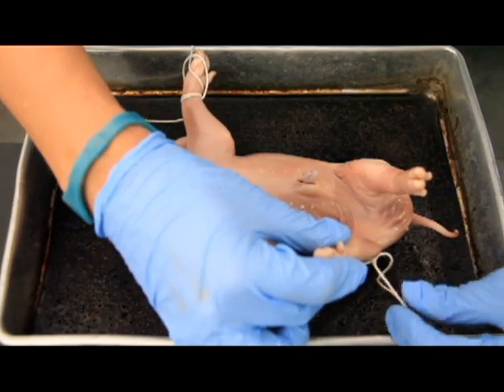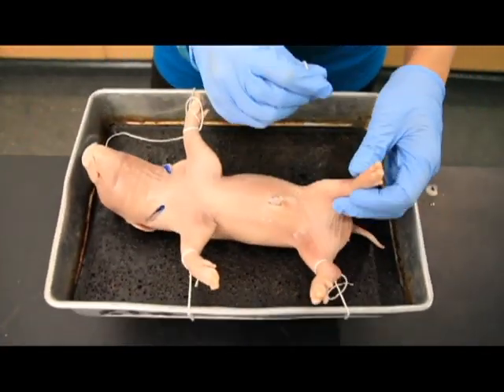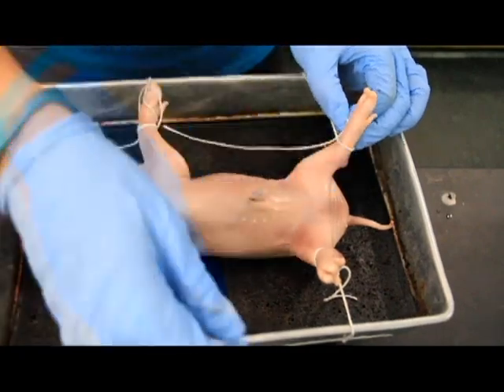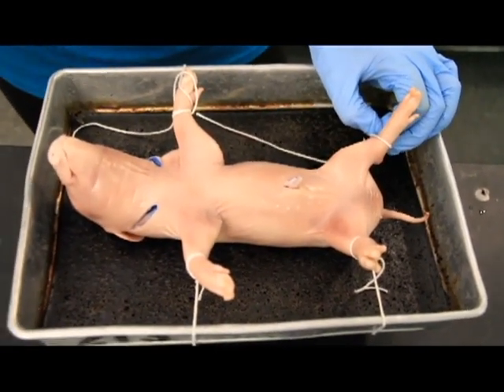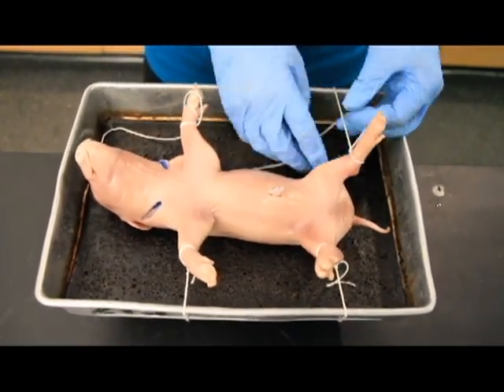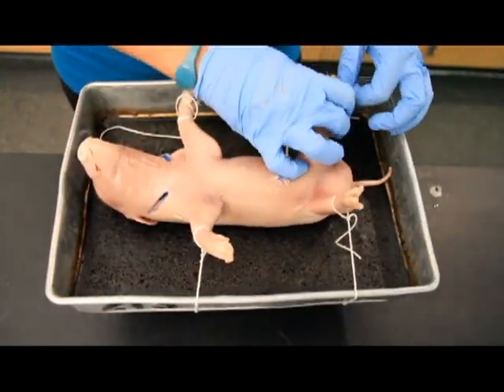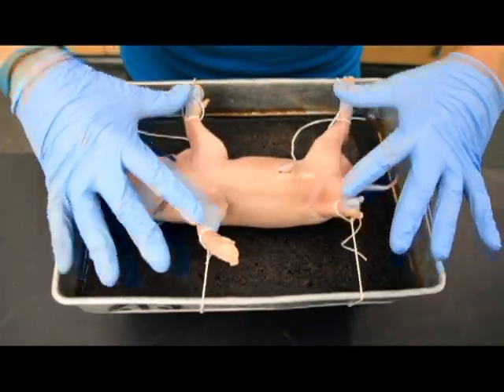So I've tied this leg here, as you can see here, and then you run the string below the tray, and then again you tie the leg nice and tight. And these knots were going to stay on there. So later when you actually remove the pig and put him away for the day, you're just going to slide these strings off and keep him on the strings so that you don't have to retie this every single week. Right now I'm going to tie a nice tight knot and keep my pig nice and splayed open. I find if you need to tuck it around the leg to make it a little bit tighter, you can do that. So now he's nice and wide open.